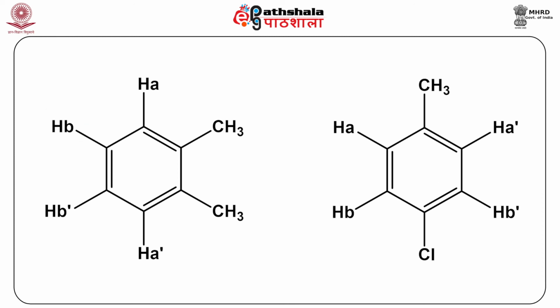Thus, the proton being observed has different coupling constants to the two chemically equivalent protons, that is HB. Hence, both HA protons are not magnetically equivalent.